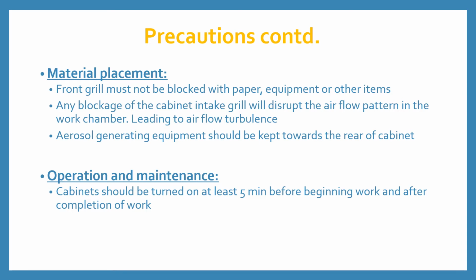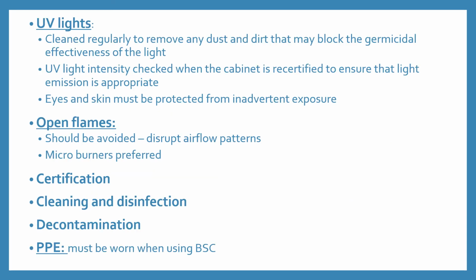Operation and maintenance. Cabinets should be turned on at least 5 minutes before beginning work and after completion of work. UV lights. The cabinet must be cleaned regularly to remove any dust and dirt that may block the germicidal effectiveness of the UV light. Its intensity must be checked when the cabinet is recertified to ensure that light emission is appropriate. Eyes and skin must be protected from inadvertent exposure.